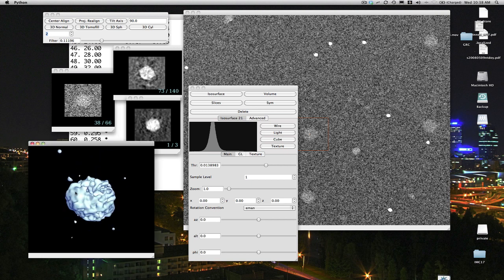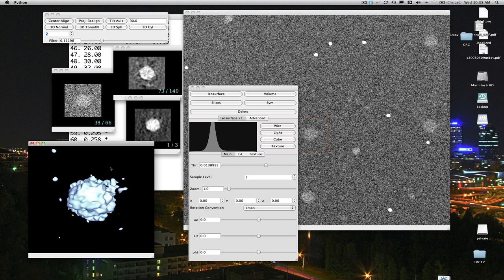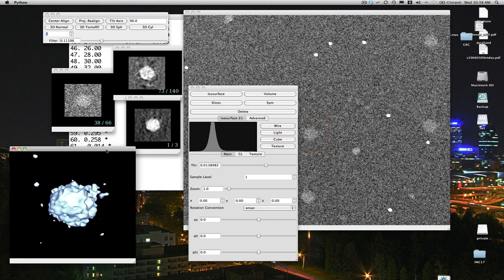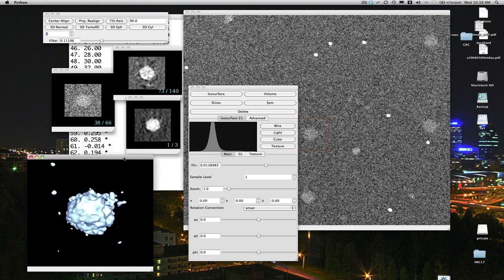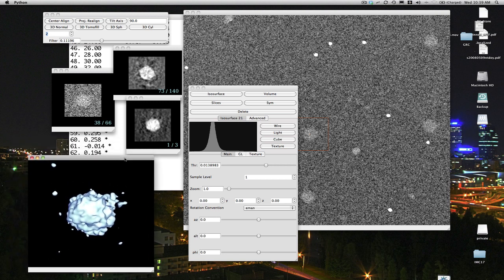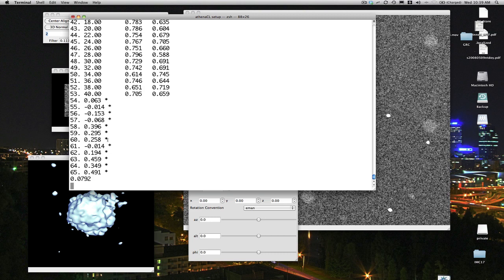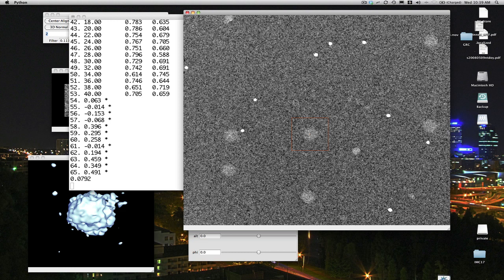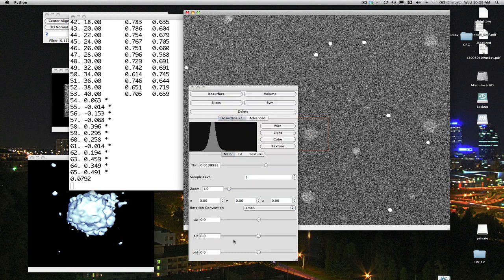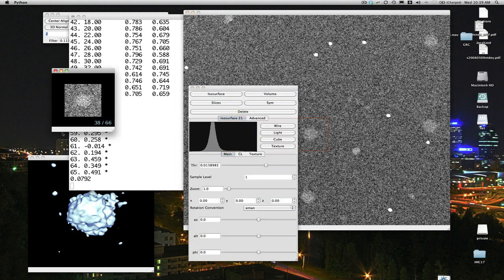Now, any other interesting things we can do here? Well, you'll notice that the reconstruction algorithm, if we look here in this window, actually correctly identified the slices that were incorrect. The slices marked with star were ones that were excluded from the reconstruction. If I find a better part of my image where it manages to do the alignments better in the highly tilted images, then I would probably find that those weren't excluded. How about looking at the missing wedge? Can we do that?